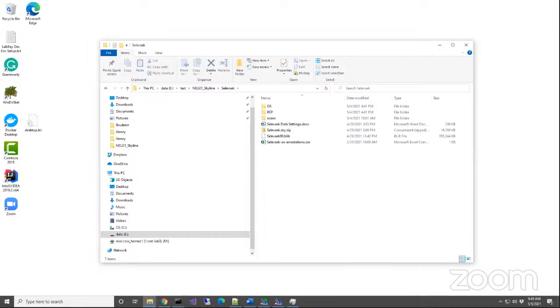There was one last question, since it's related, that just came in. It says for Bruker instruments, recalibration in the software just adds an additional calibration file. Does Skyline recognize that? Well, Skyline doesn't recognize that, but the Bruker software does.